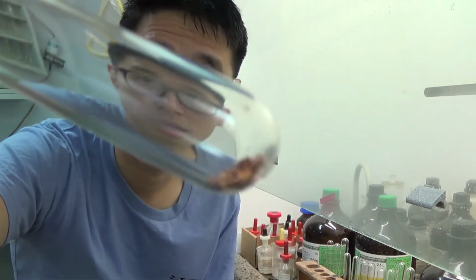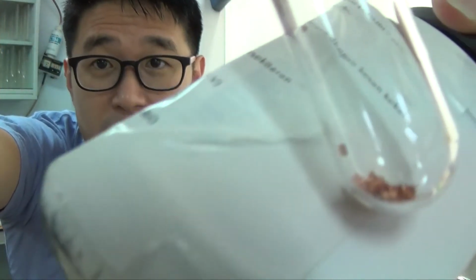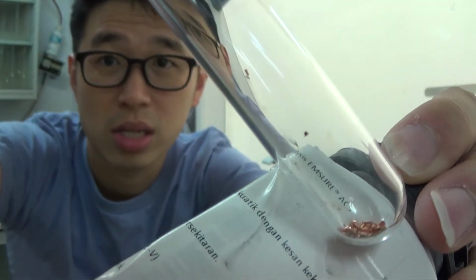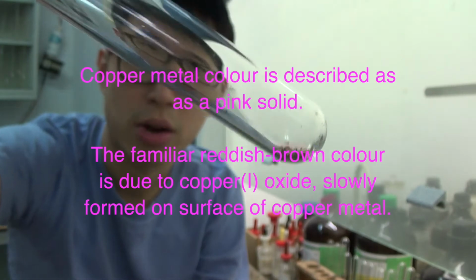So this is the color of copper. Oh, it's not very clear, is it? I should have a white background. There you go, there's the white background. So this is copper metal. This is the appearance of copper metal, and if you ever produce copper metal or copper solid, this is how it will look.